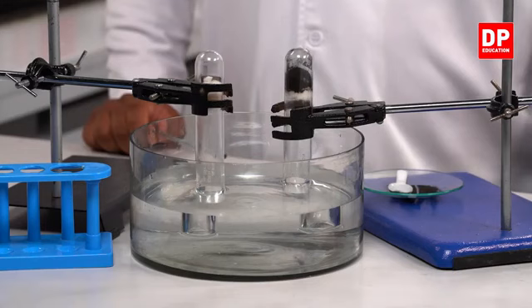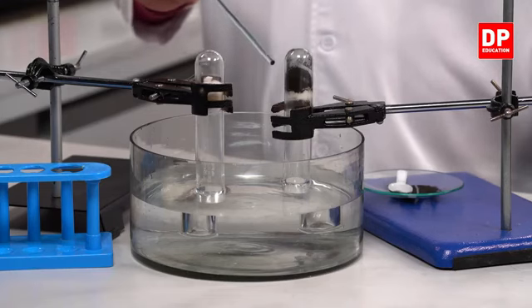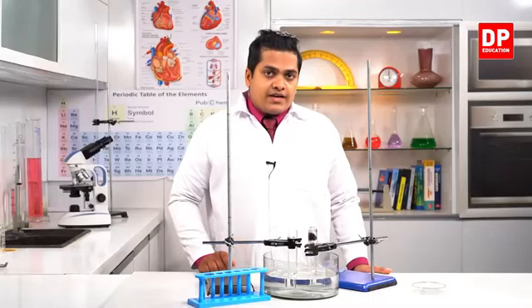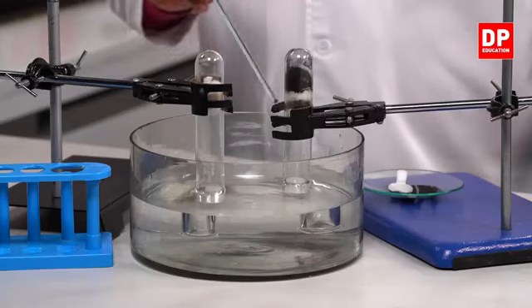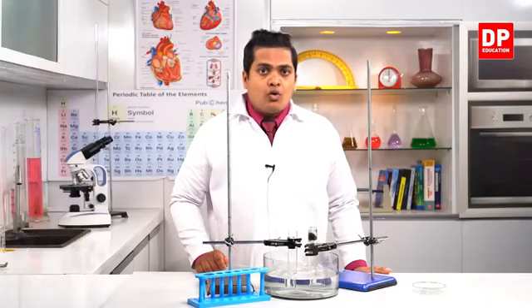It's like this. When some change occurs inside the first boiling tube, if some amount of gases are absorbed during the process of rusting, then to fill that gap, some amount of water will rise through the boiling tube. But we don't know the volume of it.